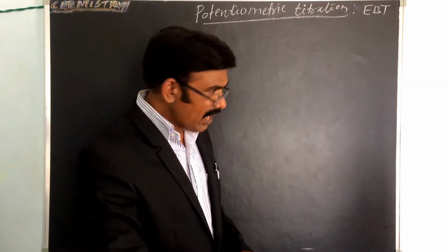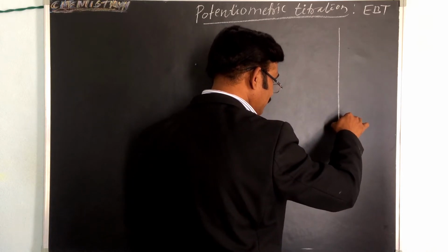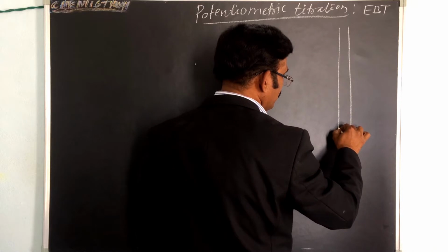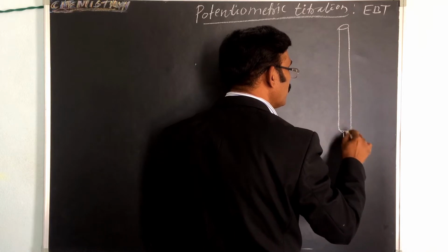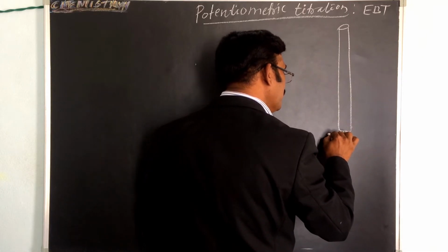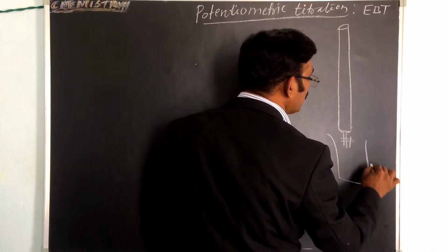There we took one burette and one beaker.